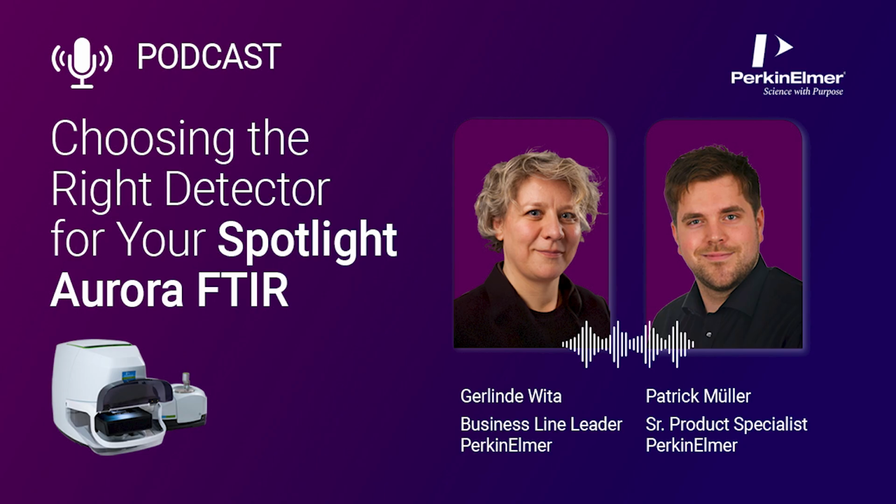Thank you. And are there any other decision-relevant factors which we should keep in mind for choosing the right detector? Yeah, one that might come to mind from what I said up to now is that for some of the detectors, you need liquid nitrogen, which is obviously a choice you have to make beforehand regarding availability of liquid nitrogen, maybe safety concerns you would have, and convenience and ease of use.